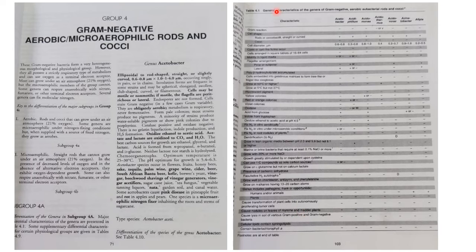This table is titled general characteristics of genera of gram negative aerobic eubacteria rods and cocci. You can see this is just one table which has around 7 genera. For comparison, there are a further 6 to 7 pages which have all the genera mentioned, but I cannot cover everything in just one video, so I am taking these as an example.